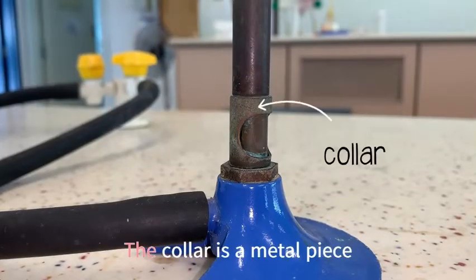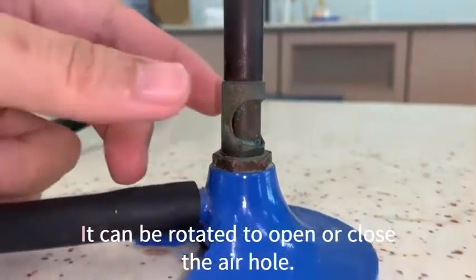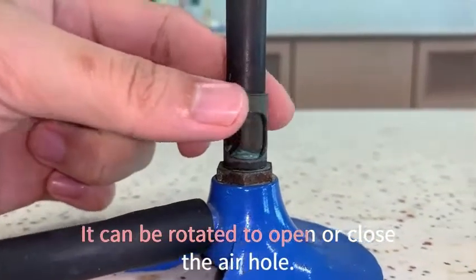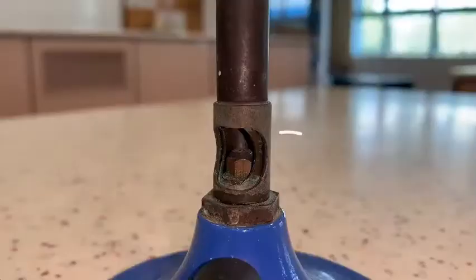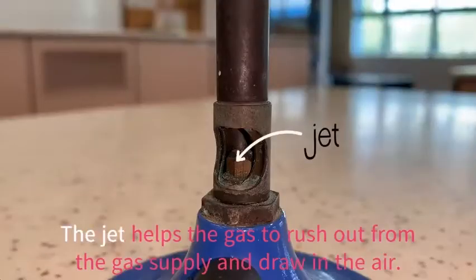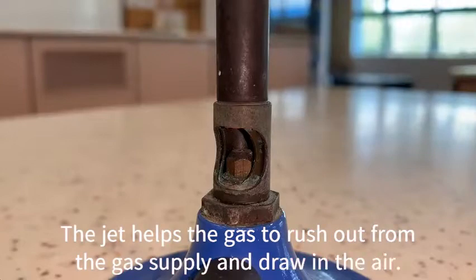Collar. The collar is a metal piece. It can be rotated to open or close the air hole. Jet. The jet helps the gas to rush out from the gas supply and draw in the air.